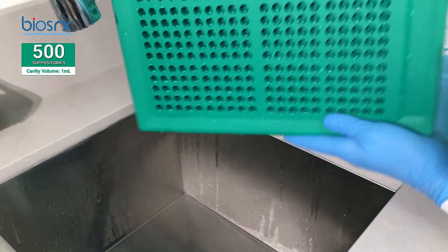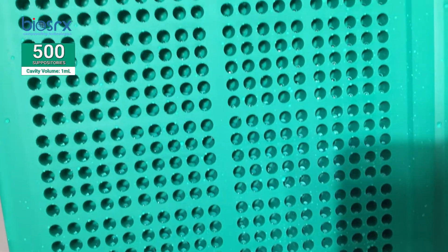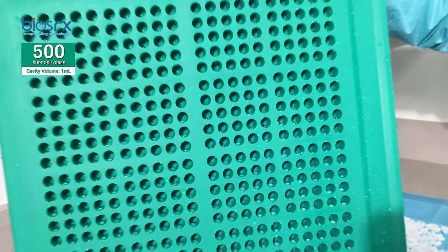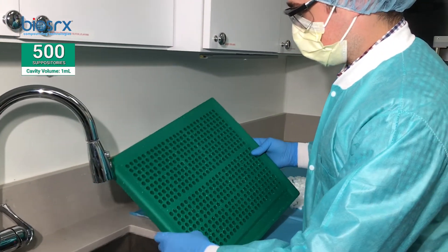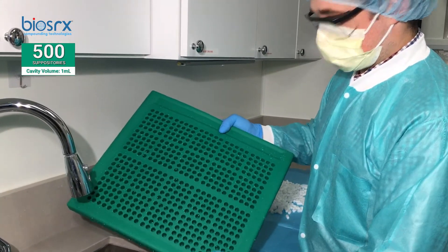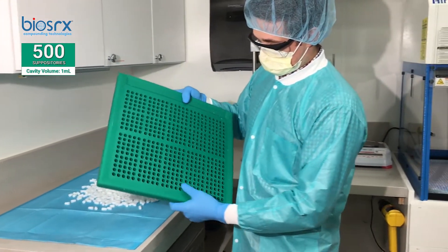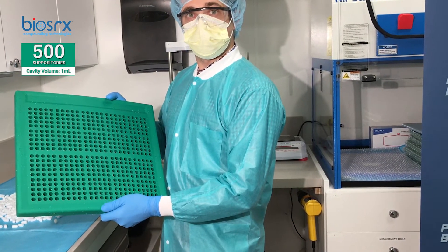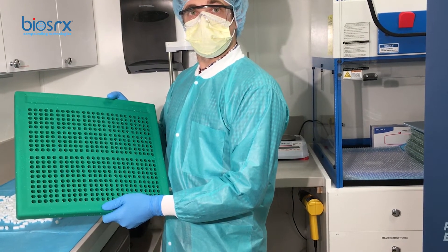Let's zoom in to see how much the tap water cleaned the mold — it looks fairly clean. You can do your own cleaning validation studies, and that's exactly what we do. Then we just put it in the dishwasher. Being a high-density silicone mold, it's very resistant and very robust — we just put it in the dishwasher and within the next day or hour the mold is all clean.